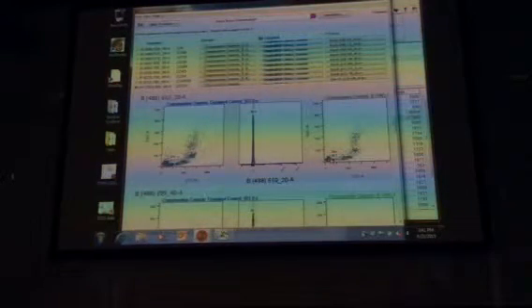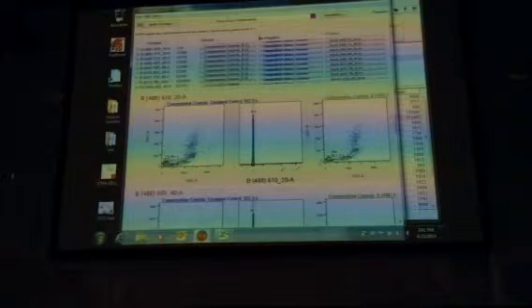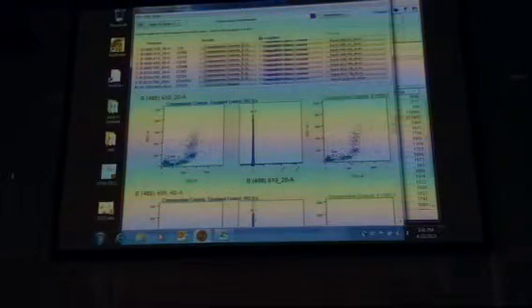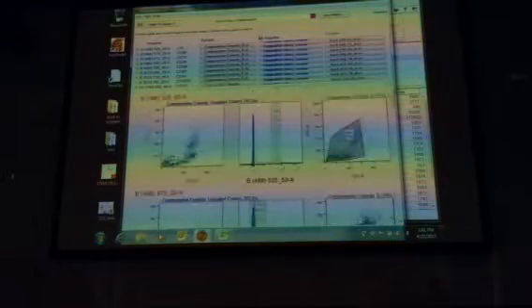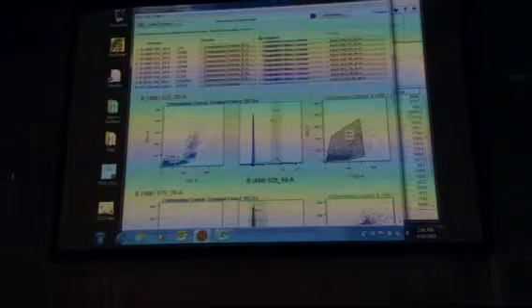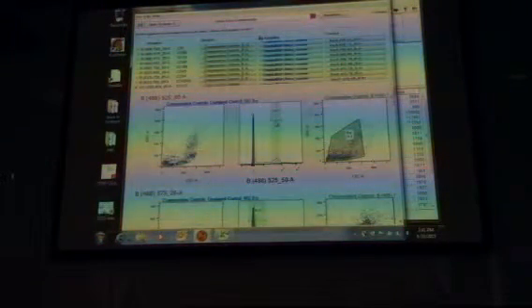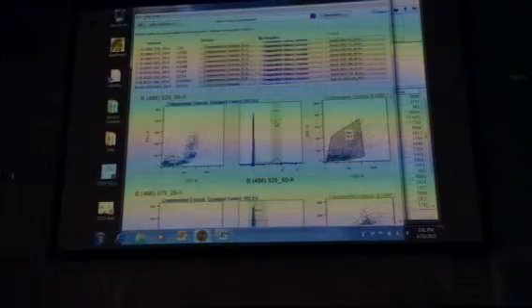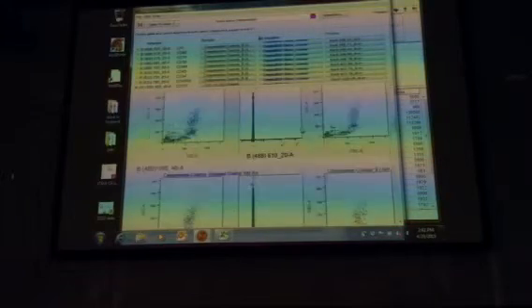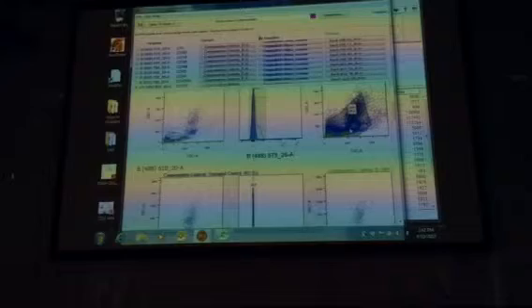What this is doing is the machine is gating on just something that's very small down here, which seems to be debris. Down here, most of the cells are here. And it's only once you gate on that do you then actually see the correct compensation and the gating on the positive population. So what you need to do is actually go through all of the different samples.